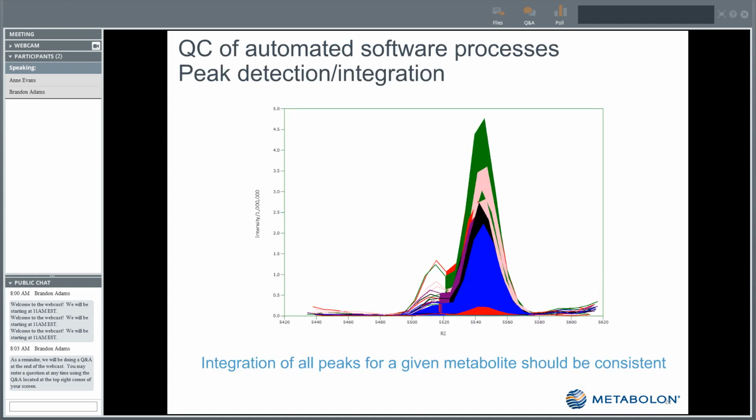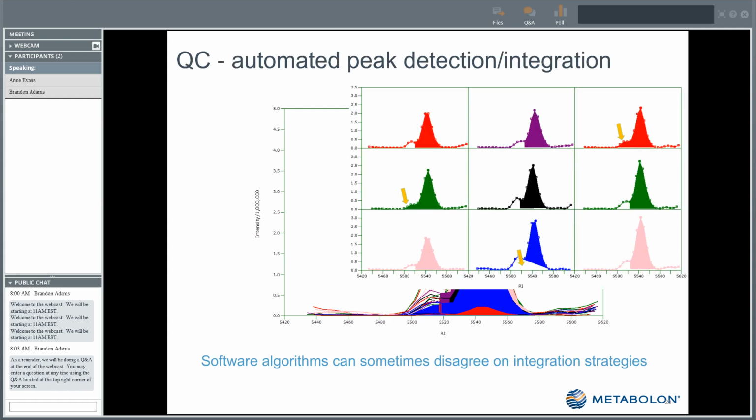The other thing that we have done is, as we started looking at the sources of variability in our samples and what is leading some of these molecules to still have higher variability than we might like, we saw that a lot of it was related to the consistency of automated software programs. We all have to rely on automated software for our peak detection and peak integration, as well as, for a lot of us, the library identifications. That is a lot of responsibility on an algorithm, and any algorithm is going to have weaknesses and flaws.